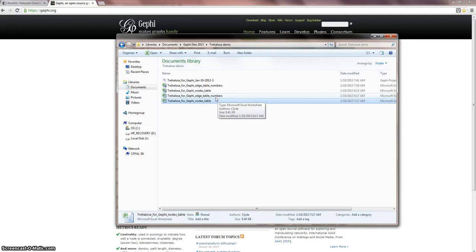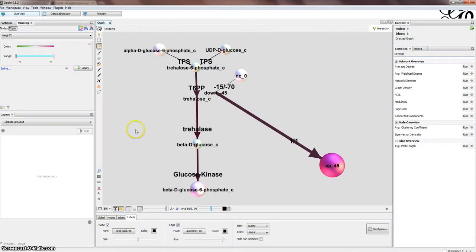I have these already open, but what I want to do is show you the end result that I've achieved so far with Gephi. And you can see we have three windows: Overview, Data Laboratory, and Preview. So I'll open this once again after we have imported, to try to recreate this in a new file. So let me just close this.